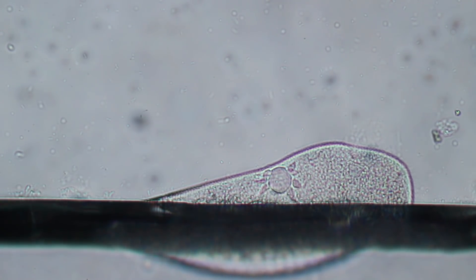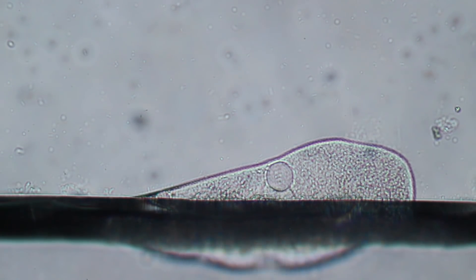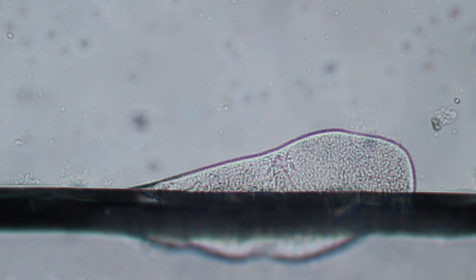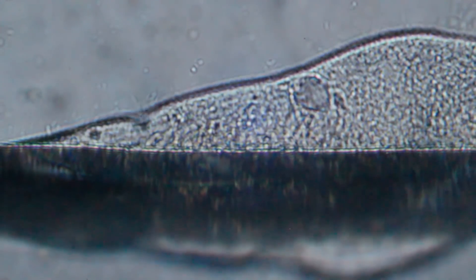The round structure that you see inside the Paramecium is the so-called contractile vacuole. This one is responsible for pumping water out of the cell. Here now you can see it contract a little bit — it's like a little water pump. I think it's slowly starting to give up here. So I'm switching now to a higher magnification to have a closer look.